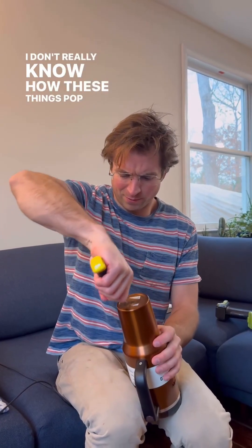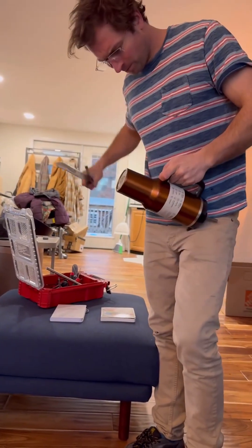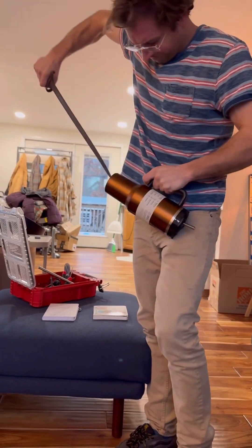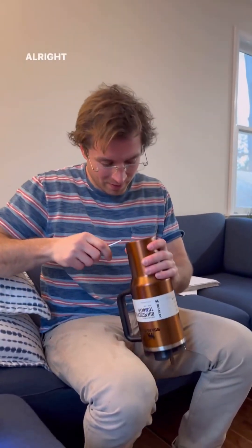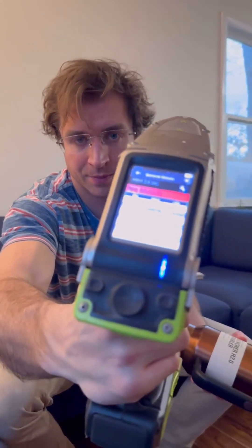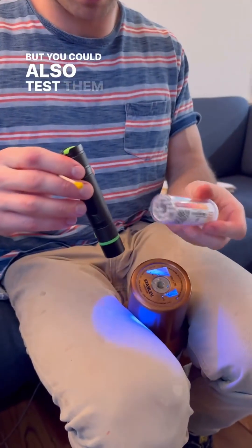I don't really know how these things pop off. They glued this on pretty good — there we go. Whoa, look out — the reading went from 500-something to about 41,000. You can just see it glowing.